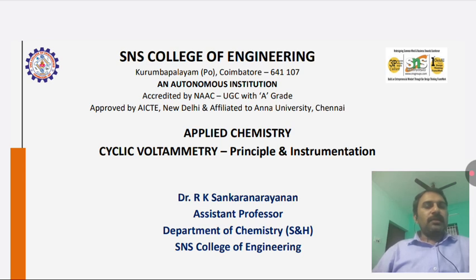So, in the applied chemistry field, how is cyclic voltammetry involved as an analytical tool in research and development and engineering concepts, and how does it work? Cyclic voltammetry is especially about applying a power supply, just passing a current, that will drive the reactions. It is an electrochemistry field. So, we will discuss its principle and instrumentation concepts.